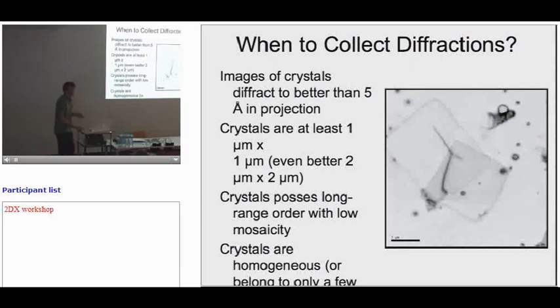And you also need to have, within a sample, pretty homogeneous samples. You only want maybe 1 or 2 different populations. If you have too many different populations, diffraction patterns in a few examples have been very difficult to segregate by themselves, particularly if the unit cells are very similar. It's almost impossible to take diffraction patterns of 2 crystals from the same sample and distinguish them on their own.